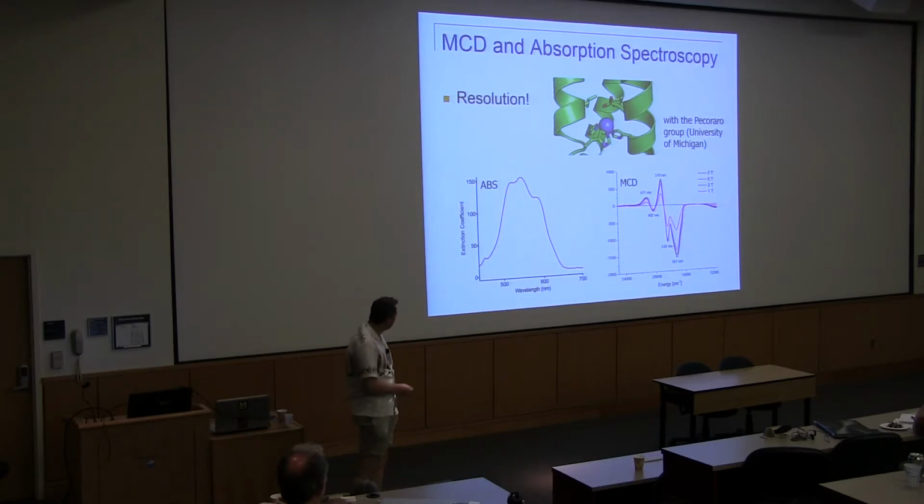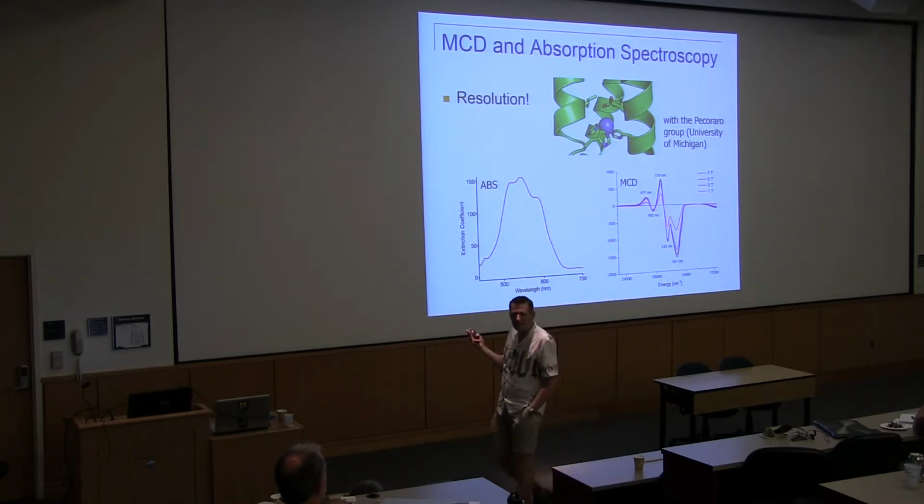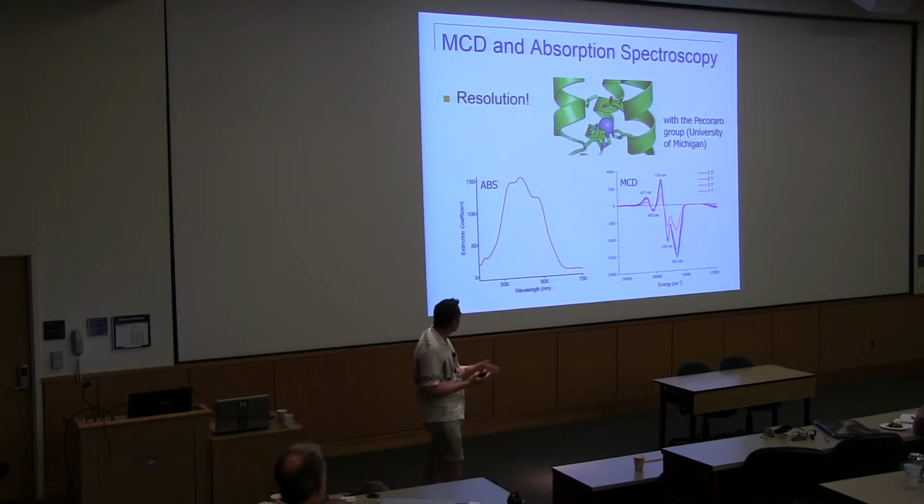And you notice immediately there are too many transitions here, so that means there has to be more than one species in there giving rise to DD transitions. Since it's copper-2, it can only have 4 DD transitions, so the sample has to be inhomogeneous. There have to be 2 different species in there.